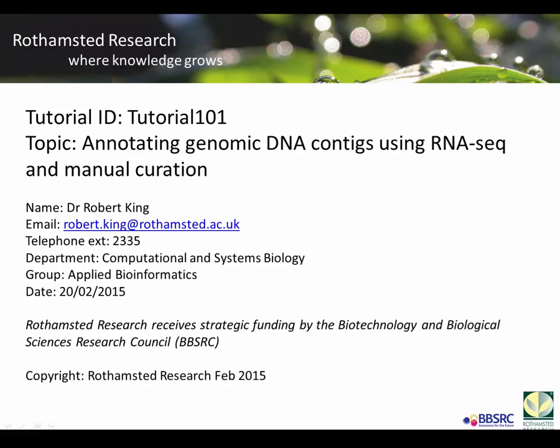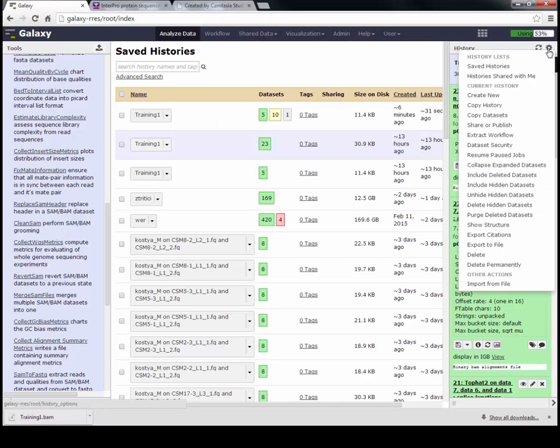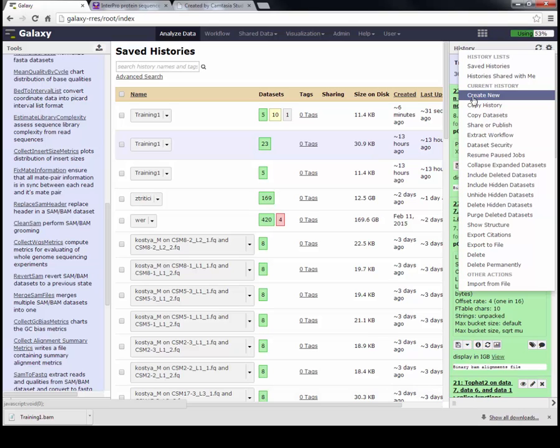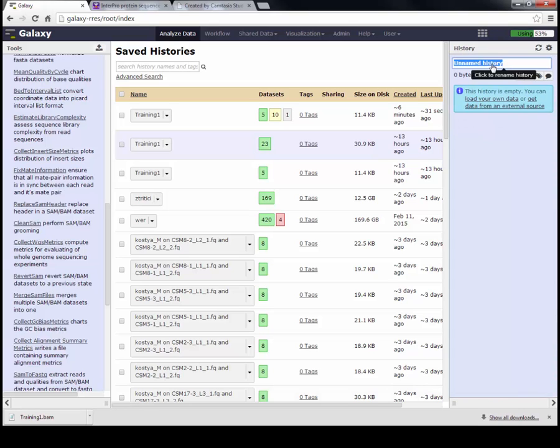We're going to do part of this in Galaxy and part in Geneious. The first thing we're going to do is set up a new history. Once you're logged into Galaxy, go to Create New. Then we're going to create a new history. If you click on the name, you can change the name. Let's just call it Training 101.